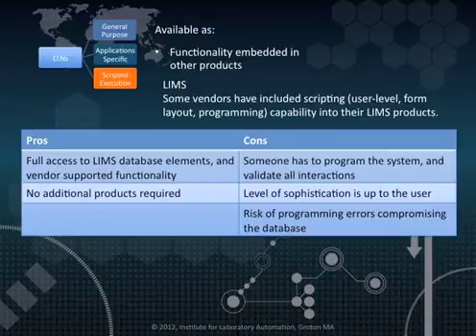As you might expect, there are advantages and disadvantages to including the scripting capability in a LIMS product. On the plus side, the programmer has access to the full database elements, consisting of all the test request information, sample description, and results. As a result of having both LIMS database and scripted execution in one package, there is no secondary process of transferring the data from the scripted execution functions into the database. Also, you're working with an all-in-one product, so no additional software is needed.